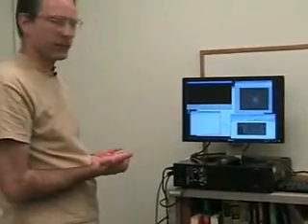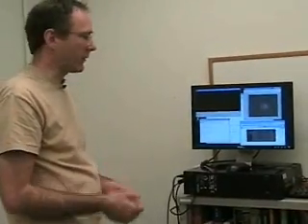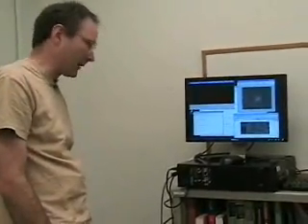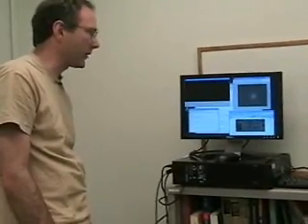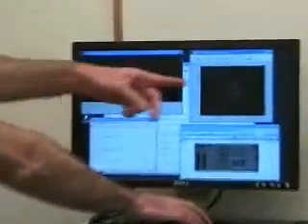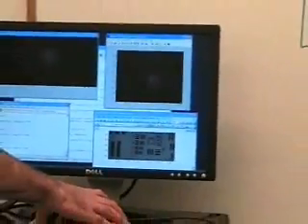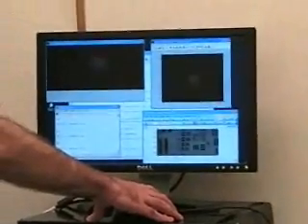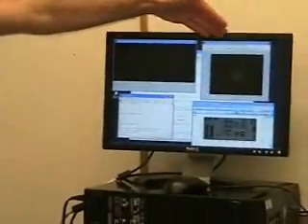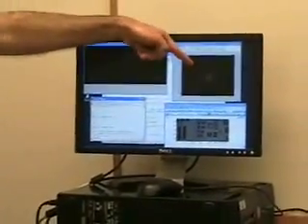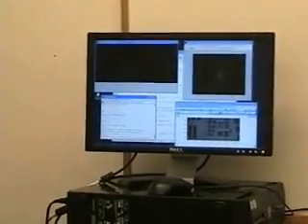So at this point, the thing you want to do is start the data acquisition program for the FRAP experiment. And that turns out to be the same program. So I'm going to open the shutter. I'm going to click over here to get my shutter and gain settings proper and acquire another image. And now I'm going to right-click. And notice how I'm not moving the mouse before I right-click. Wherever the mouse is when you right-click is the shutter and gain settings you're going to have going forward. So what I like to do is I'll do a normal left-click to see that the shutter and gain settings are what I want. And then I'll right-click. And that begins the next phase of the program. And since that takes a little while, I'm going to close the shutter again.